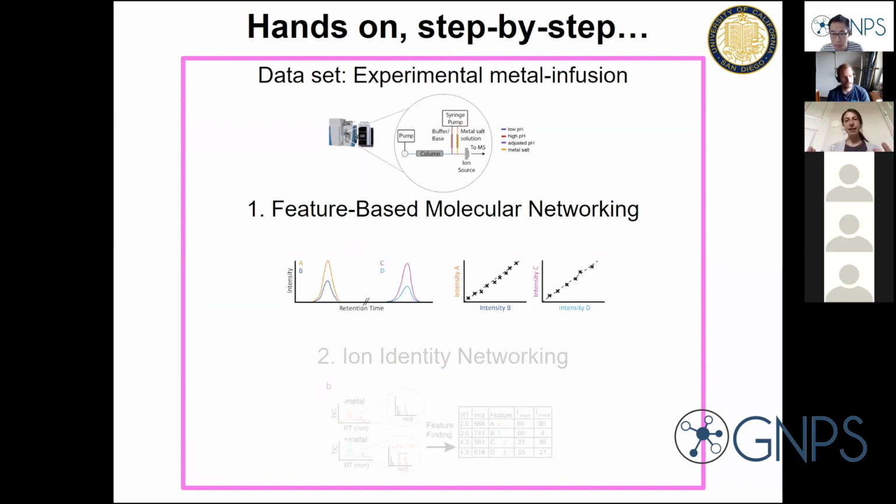What this entails is changing the pH of our experiment. Typically we run mass spec at low pH, but now, as you can see in the picture, we're running our sample through the column, and then we're raising the pH by the introduction of either a buffer or a base to some neutral and potentially more physiologically relevant level.